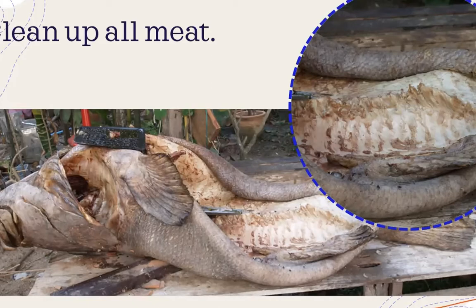If it is a small specimen, anytime you can put it in the heat. You can put it in a hot machine or something like that, and you can do more. But a large specimen is not easy, because we need a whole sunny day to dry it. And another thing we remove: the gills should be removed, and all the meat in every place.